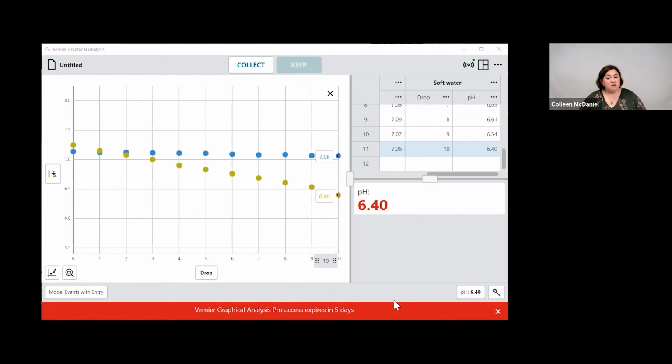You also have the ability to just make your own water. So the soft water and hard water that I have here is actually a homemade variety, where all I did was take distilled water, and with the hard water, I mixed in about, so this is 200 mils of hard water, I put in 20 milliliters of a pH 7 buffer.